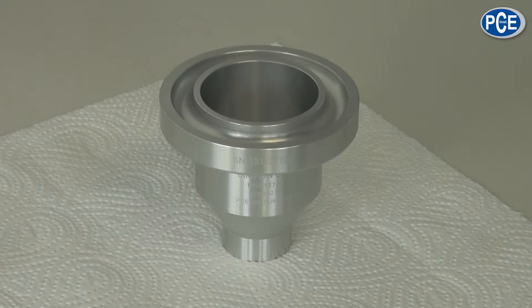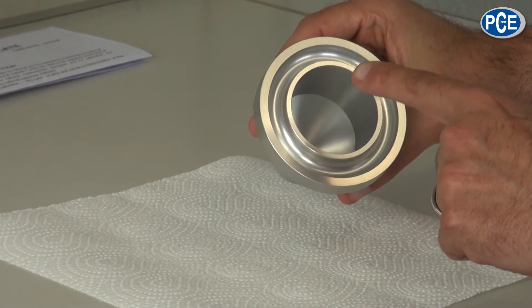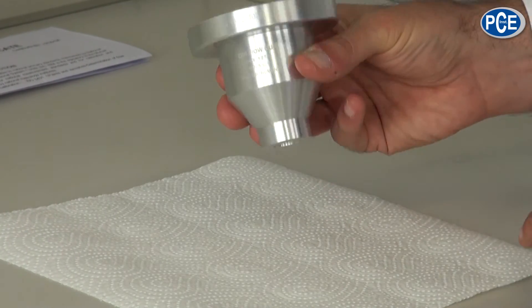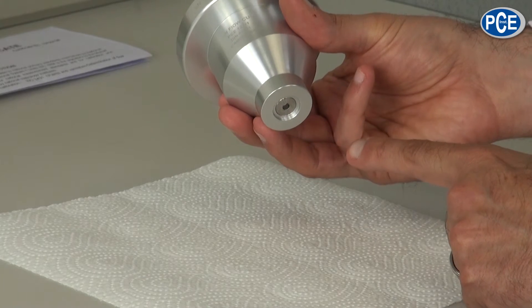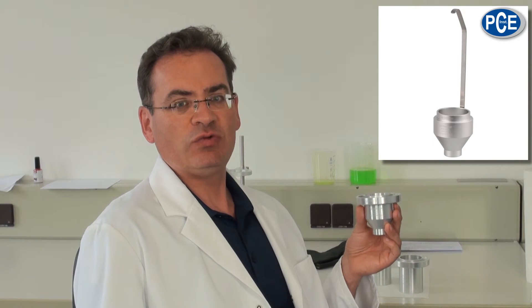The Flow Cup has a volume of 100ml. On the top it has an overflow rim, and on the base an outlet nozzle. The DIN Flow Cup 127 is available as overflow and pot versions, and has a fixed nozzle of 4mm.